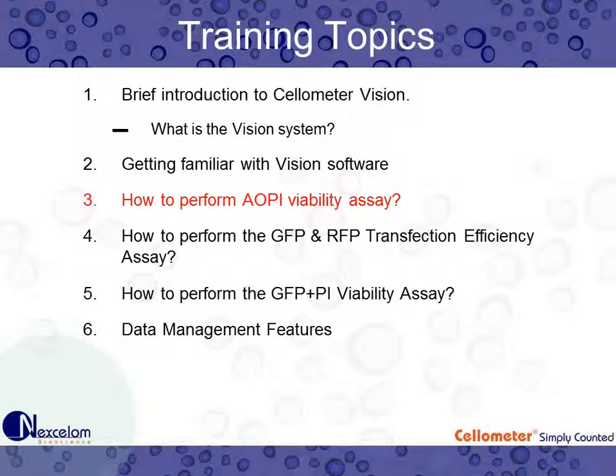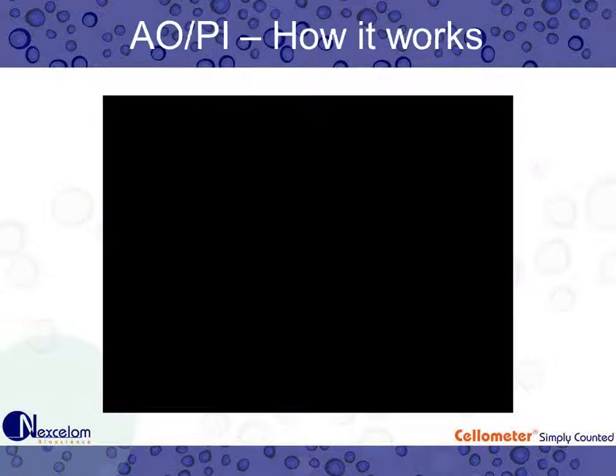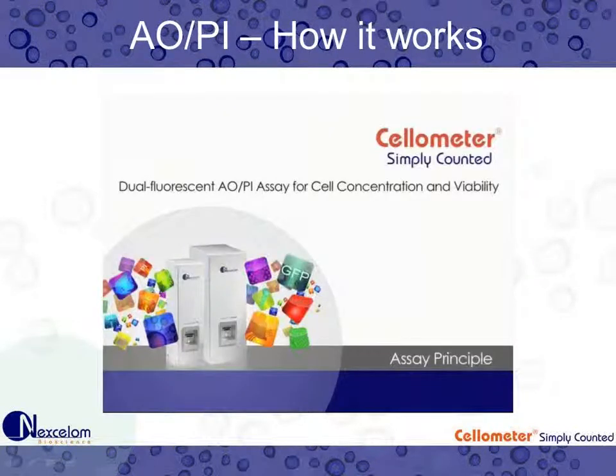So the question is how to perform an AOPI viability assay. And so I would like to show you a brief video that talks about this assay.